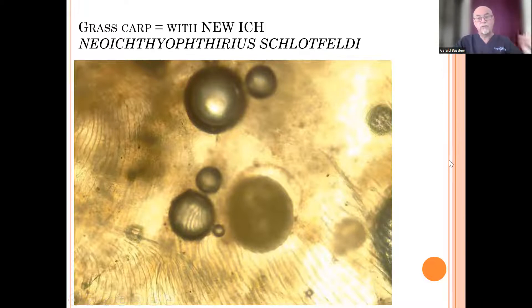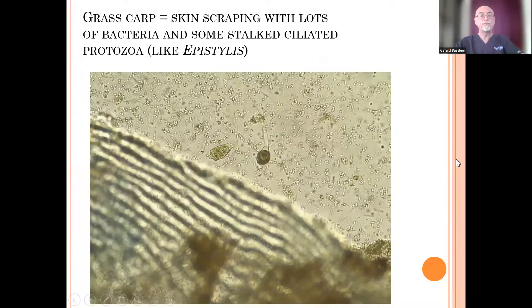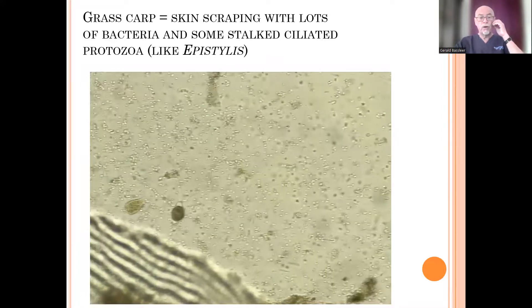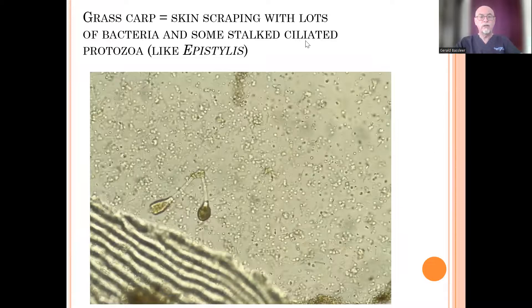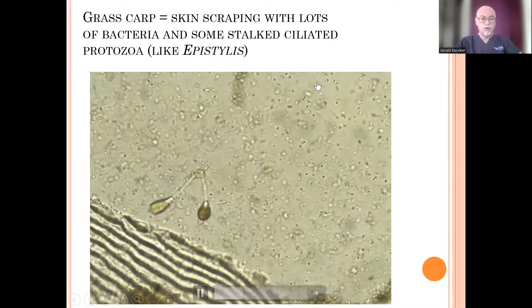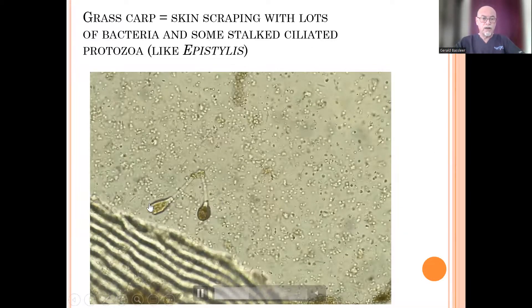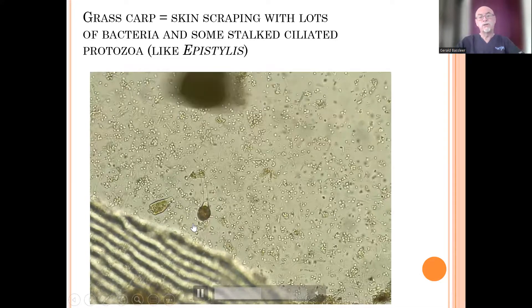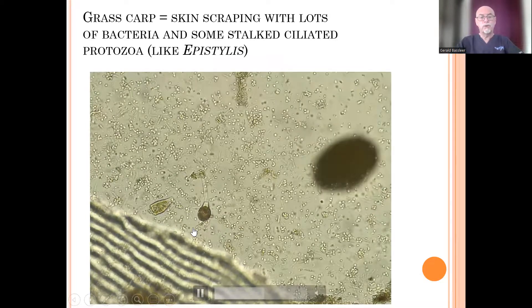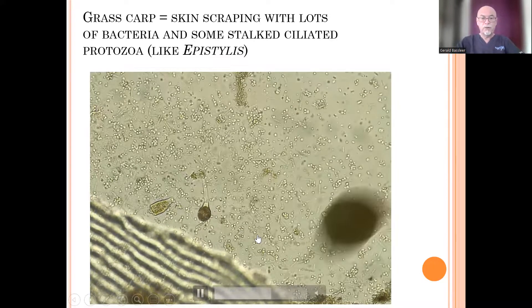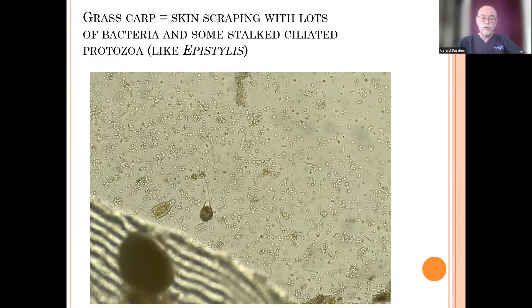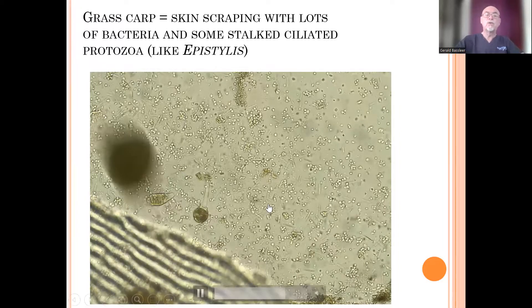The skin scraping also showed we had a few stalked ciliated protozoa that look like Epistylis — they can also penetrate into the mucus. And look at this — a white spot quickly moving around. Yes, this is the unusual white spot parasite, Neo Ichthyophthirius.